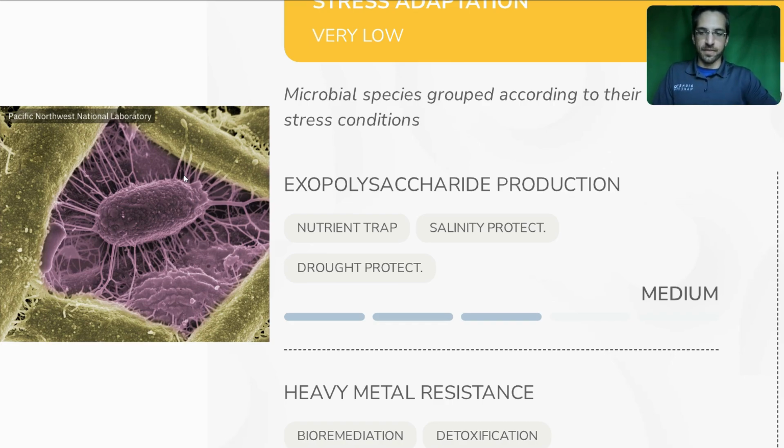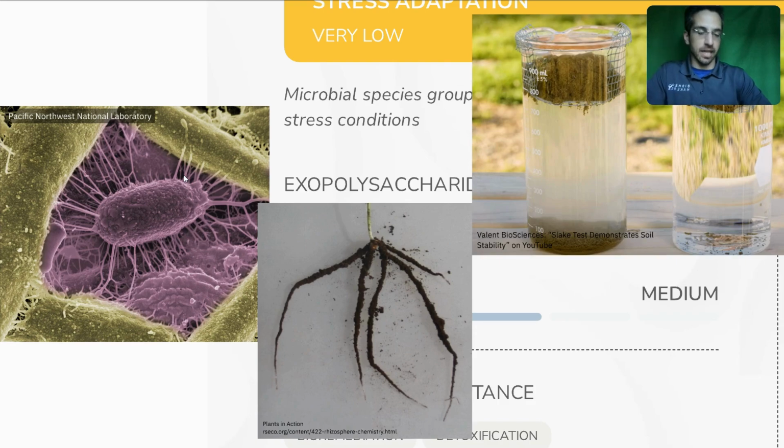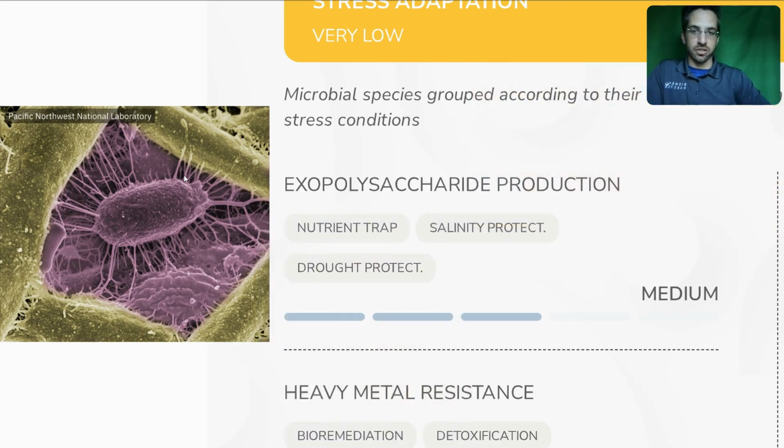And so that will help with drought stressors. It will help retain nutrients, like I said, and it is going to be a soil building process. These are our architects in the soil. They produce rhizosheaths, more comfortable, more growth promoting environments around the root. Like I said, they produce water stable aggregates as well. These contribute to having a good result on your slake test.